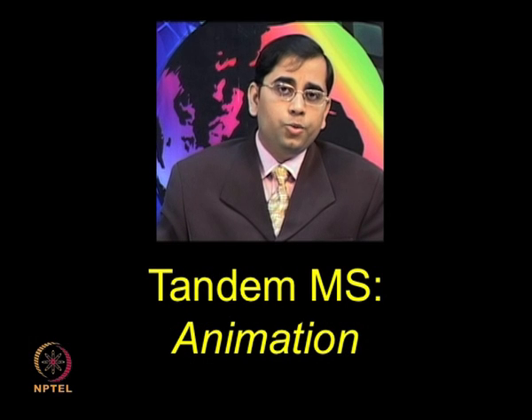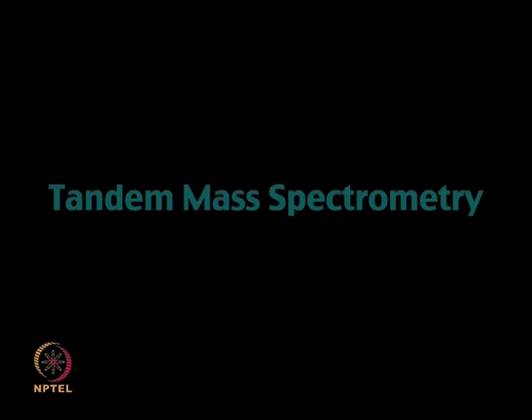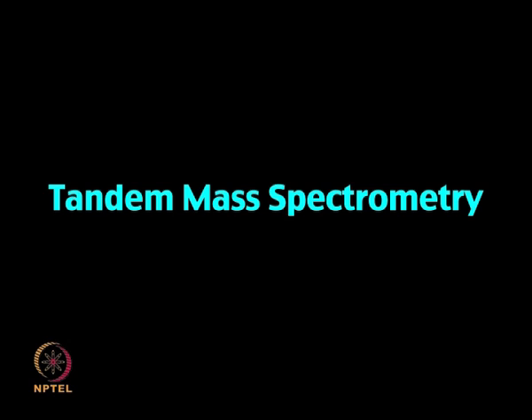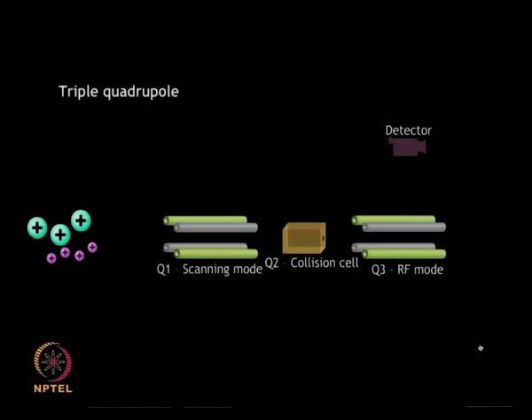For some of the commonly used Tandem MS configurations, let me show you this animation. Tandem mass spectrometry: combination of various mass analyzers in tandem gives rise to tandem mass spectrometry. The triple quadrupole consists of two sets of parallel metallic rods, which are interspersed by a collision cell. The first quadrupole scans the ions coming from the ionization source and allows only ions of a particular m/z ratio to pass through.